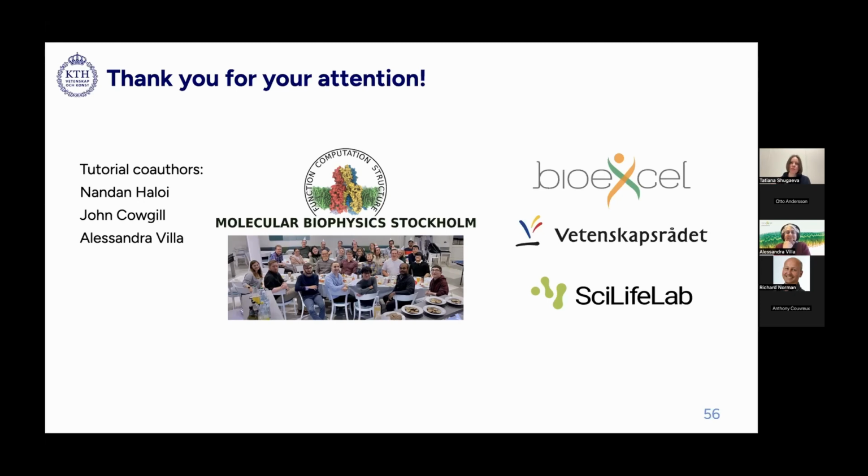But what I noticed is that when you want a significant conformational change, the charges that are not shielded by the solution around the protein have a very strong impact. I know that simulating in water is slower, but you will get a much more physiologically relevant result.